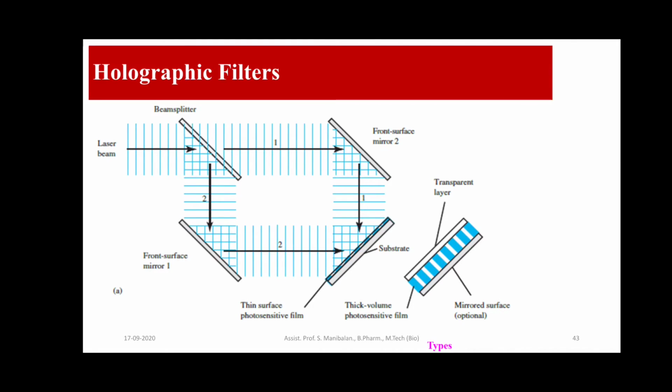Both get reflected, and again those light waves, or any EMR waves, are rejoined at the plates which have the photo emission, or photoelectric or emulsion-containing plates like negatives.